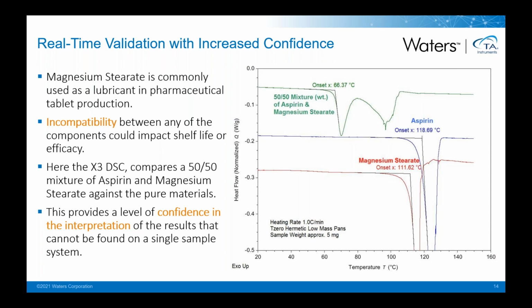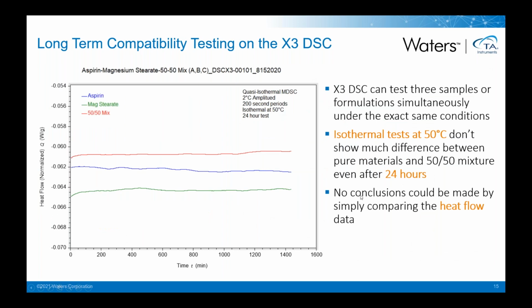But obviously, as we increase temperature, the reactivity might change, and our bathrooms or our homes, or even a shipping truck or a delivery truck out in the hottest places, let's say Death Valley here in the U.S., are not going to see 100 degrees C. They might not even see 80 degrees C. So that's where we can take it a step further and say, well, I want to know what the compatibility of these two materials might be at a more reasonable temperature.